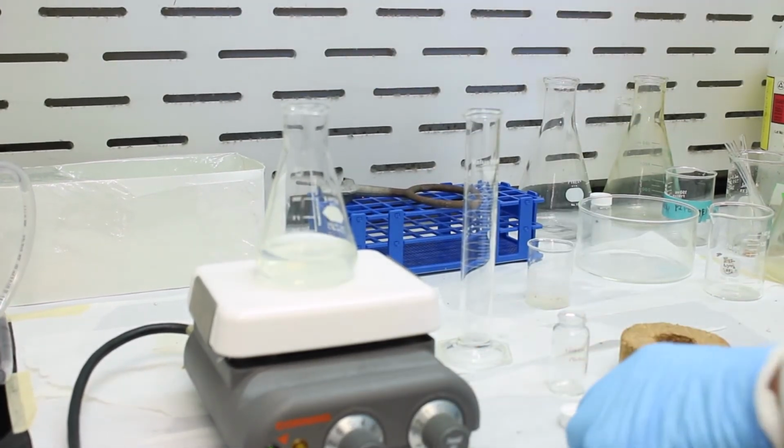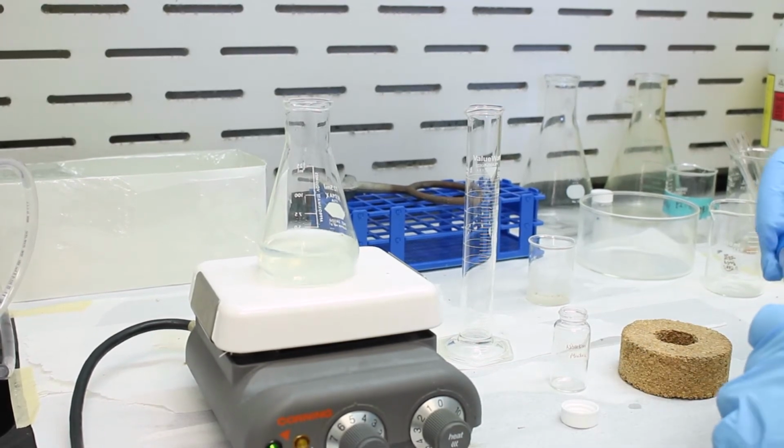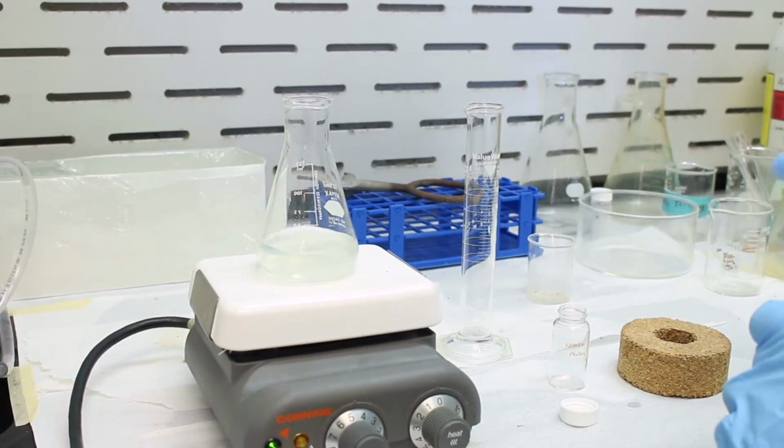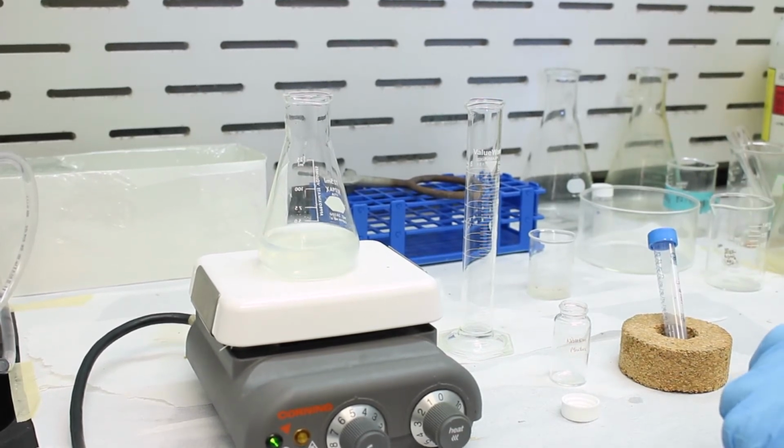Okay, and that's it. So we're simply going to let this stir at room temperature for about an hour. And over the course of the reaction, the mixture should turn yellow as the formation of the product increases.